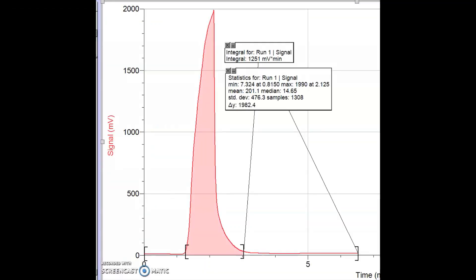Here is our information that we generated in the gas chromatograph for our n-propanol sample. I've done two things with LoggerPro to get us some more information. First, I've run the statistics — I went up to Analyze and selected the statistics option for run number one. That gave me the maximum point here, which is at 2.125 minutes. That's the peak of that curve.